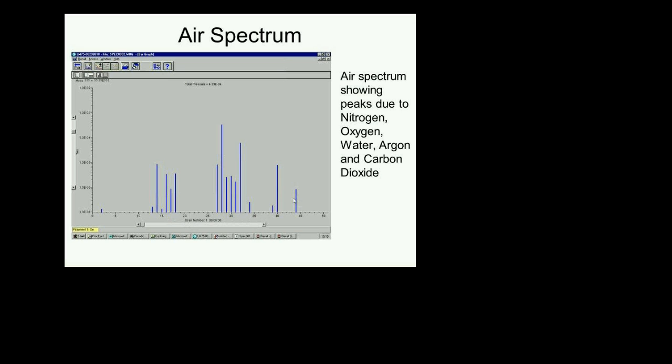So very often, people will tell me in the lab, I think I have a leak. I'll go, do an RGA scan. So they'll do the RGA scan. I say, do you see nitrogen and oxygen? They go, yeah, I do. Are they in the right ratio? They say, I think so. And then the 4-to-1 ratio? I think so. I said, do you see argon? Particularly if this is a system where we never put argon in it, he goes, yes. I said, you've got an air leak.